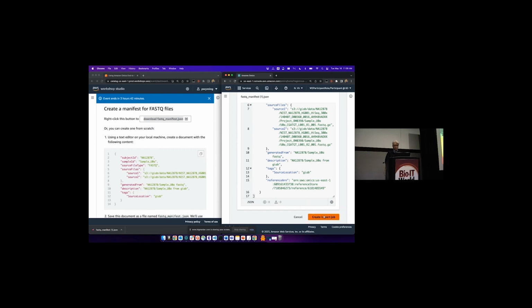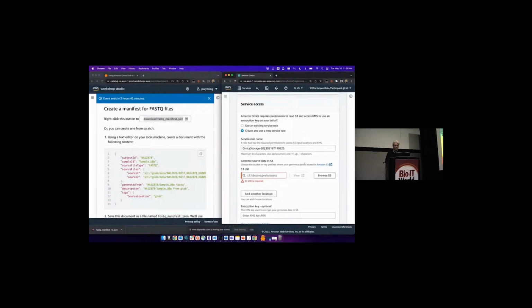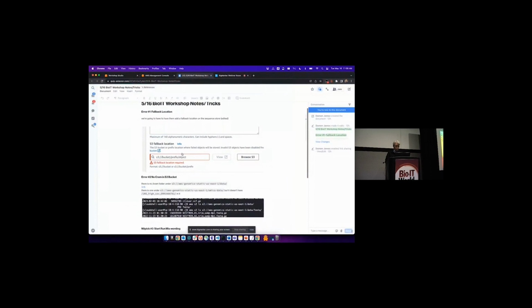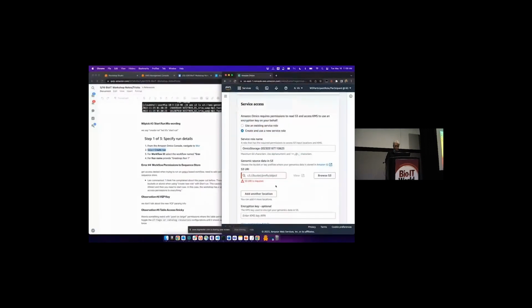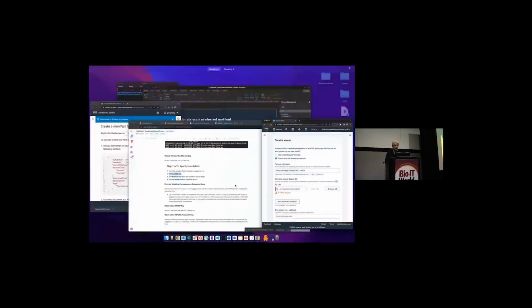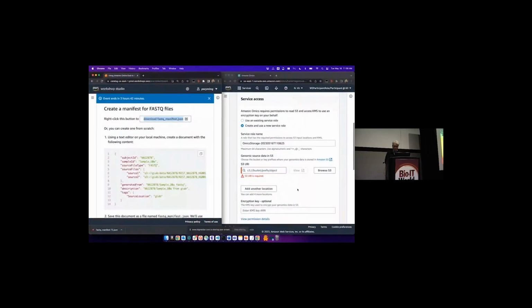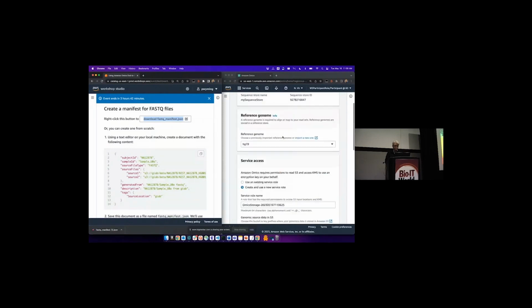Okay, so we'll create import job. What is it saying here? This might be one of those new things that folks were telling me about. Fallback location. Hey, Doman, do you remember what the fix was for here when you import? Yeah, the fallback location is part of our new release of direct upload.